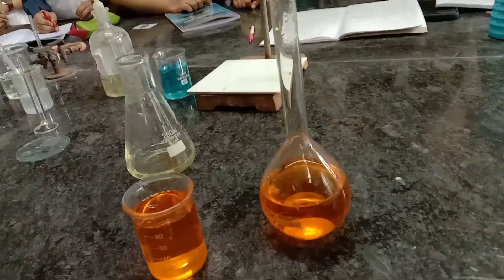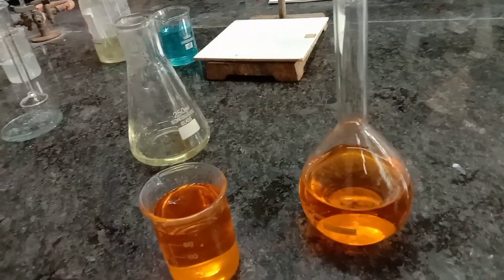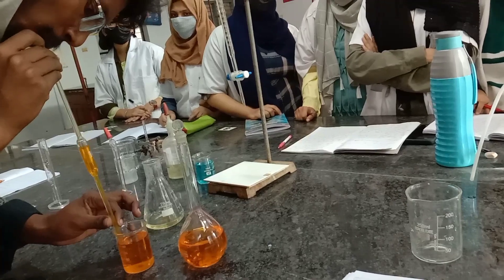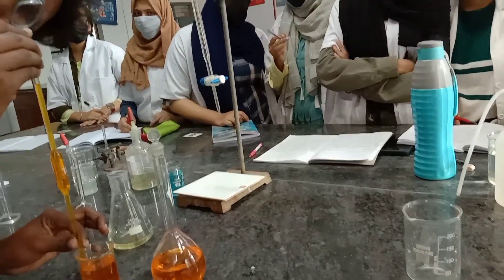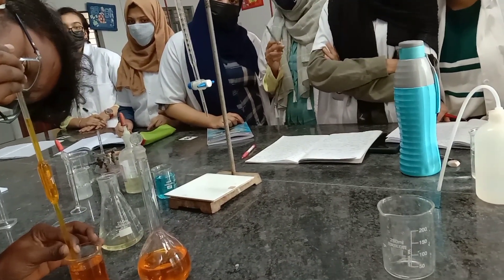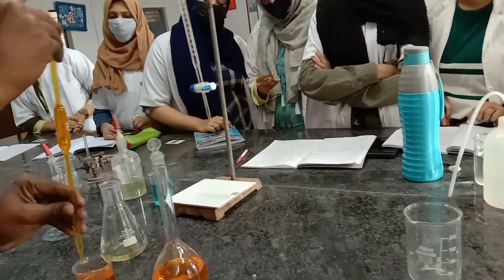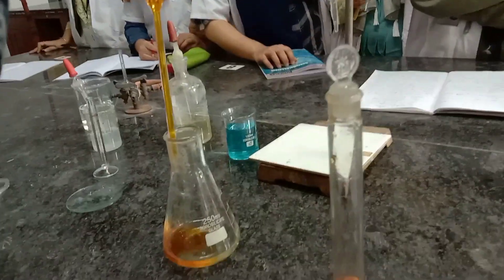We are not supposed to directly pipette out from the volumetric flask. Transfer some solution into a small beaker and from this, pipette out carefully 10 ml of standard K₂Cr₂O₇ solution. Here also, the upper meniscus has to be checked. Transfer this 10 ml into the conical flask.